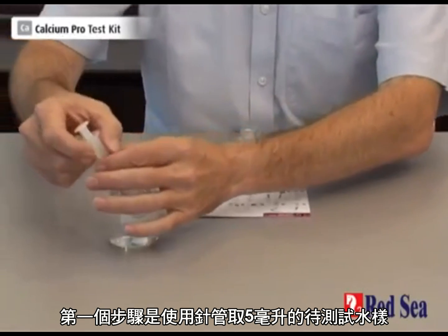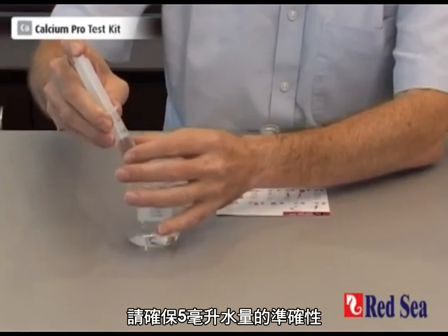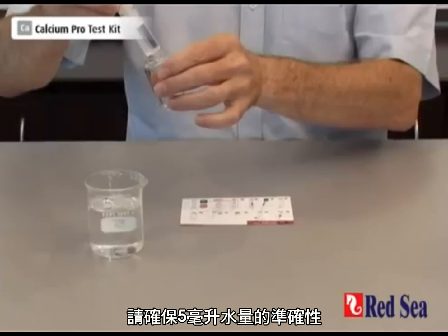Stage 1 is to take 5 ml of the water to be tested. We take that with the syringe, making sure that we are accurate at the 5 ml mark.